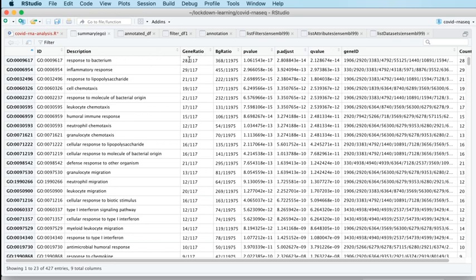So in our 117 genes that we've ended up giving to enrichGO, which is lower than 141 because there's a little bit of attrition, of those 117 genes in our selected list, so in the balls that we've pulled out of the pot, 28 of them are red balls. So 28 of them have this annotation response to bacterium. In our universe, so the background ratio, there are 368 genes in total out of nearly 12,000 genes in our universe, which carry this annotation.